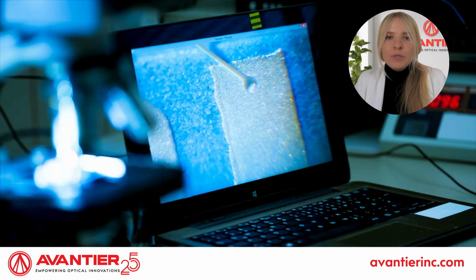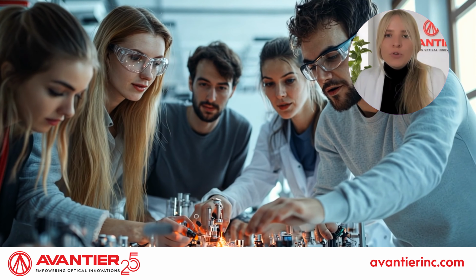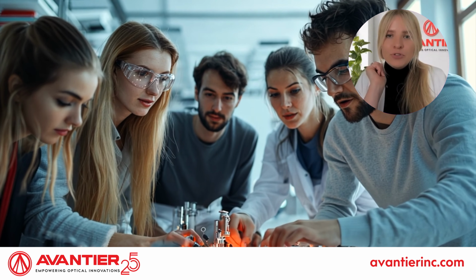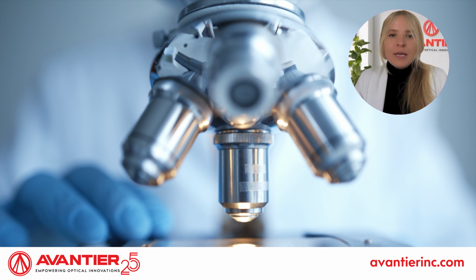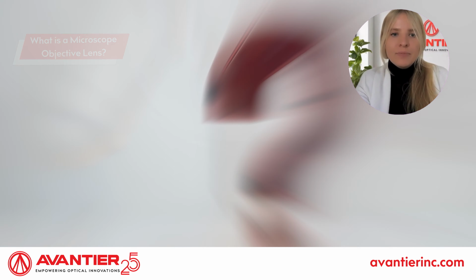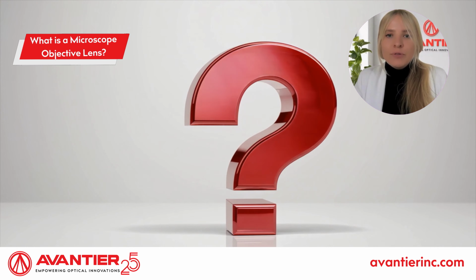These are critical components in microscopy imaging systems, allowing researchers to observe fine specimen details. Whether you're new to microscopy or looking to expand your knowledge, this video will cover essential details about microscope objective lenses, their key features, and their role in scientific research. Let's get started. Let's begin by understanding what microscope objective lenses are and why they're so important.